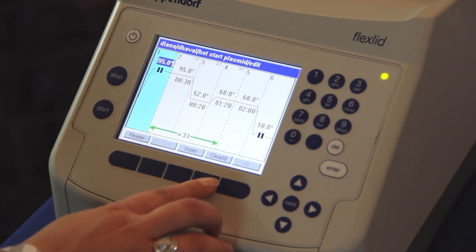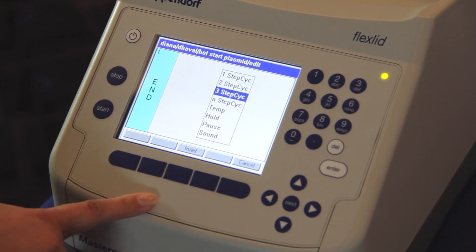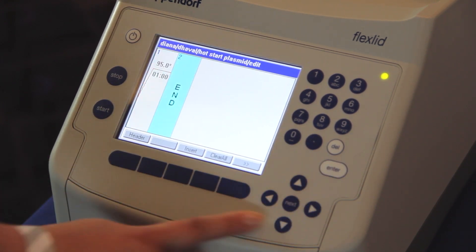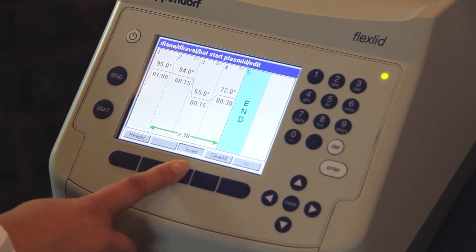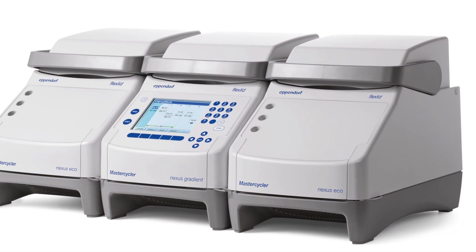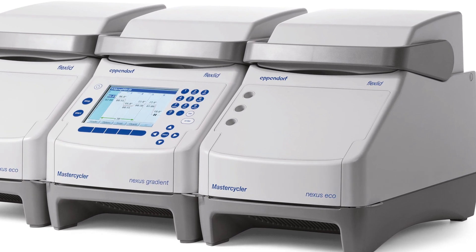As it's a graphical display, if you have multi-users it's very easy to use and you can put programming in seconds. What's also very nice if you have a lot of multi-users is that you can get it to email you when it's finished, so it's networkable — and that's always a really good feature.